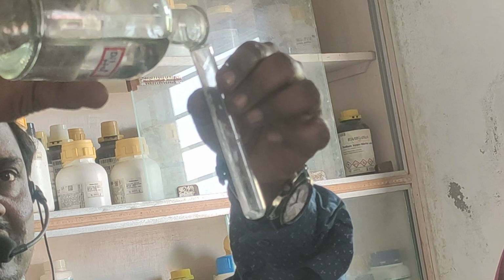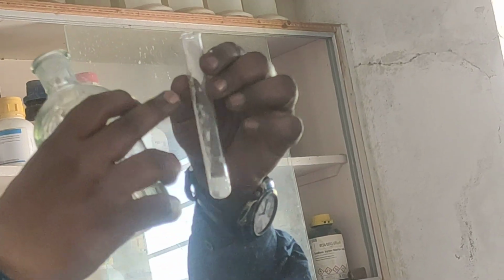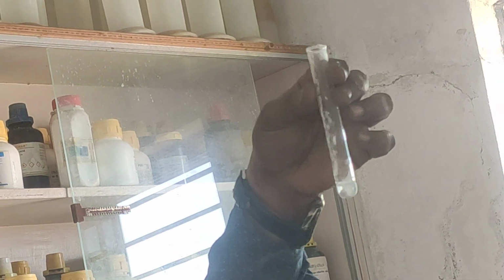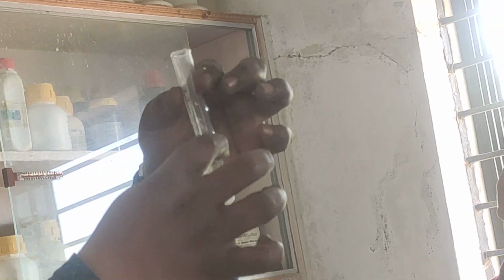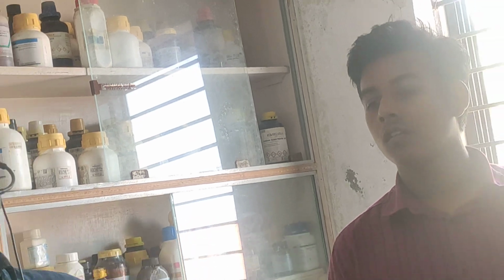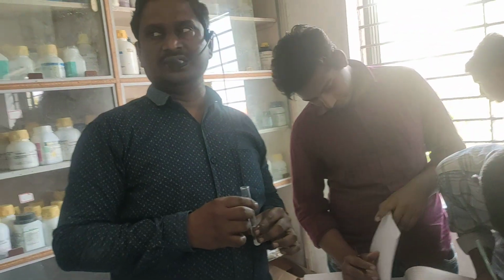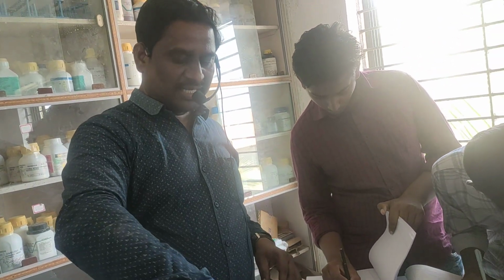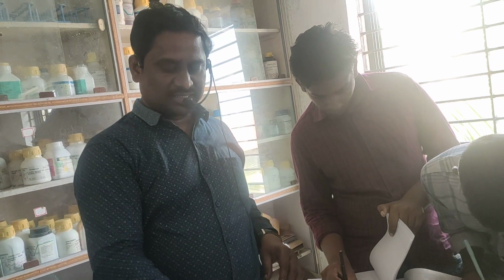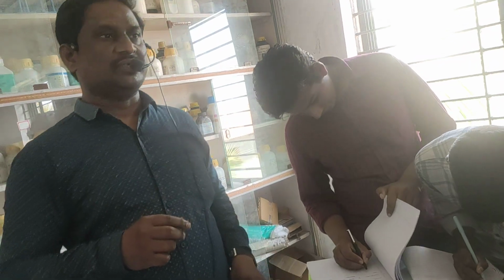For the given salt I am adding dilute HCl. You can observe, it is coming out fast. Colorless gas is evolved. In the test tube, some moisture content will be there. Salt plus dilute HCl: colorless gas is evolved. First group is present.